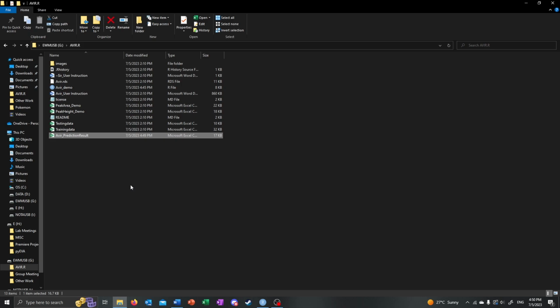This concludes our video on how to use AVIR. We hope that it helped you with your metabolomics workflow.